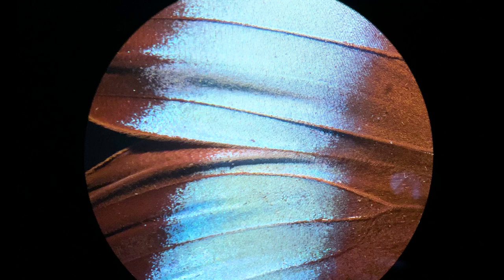Kind of looks like nylon fabric. Like some sort of fabric or something like that. You can see all the scales that it's made out of. And they're even covering that vein part.